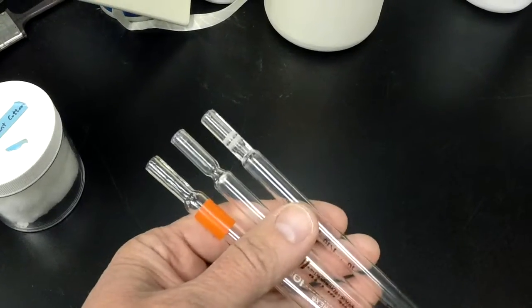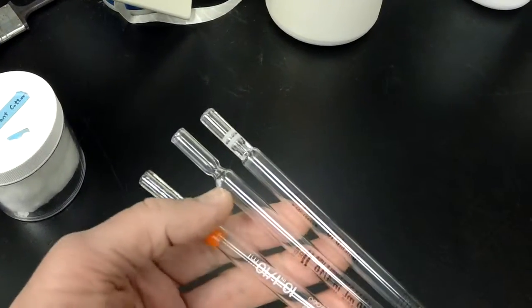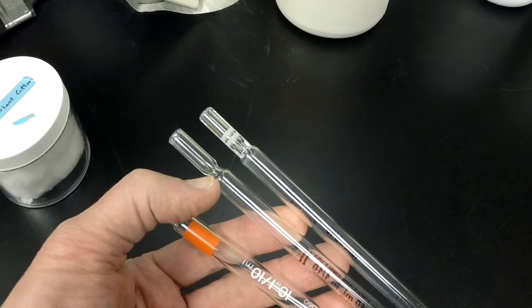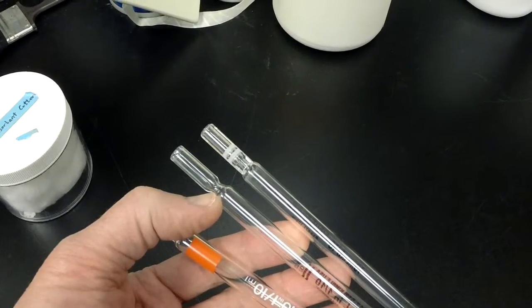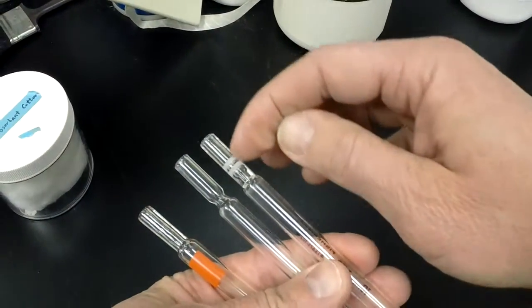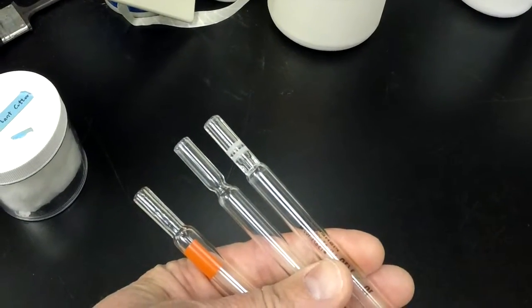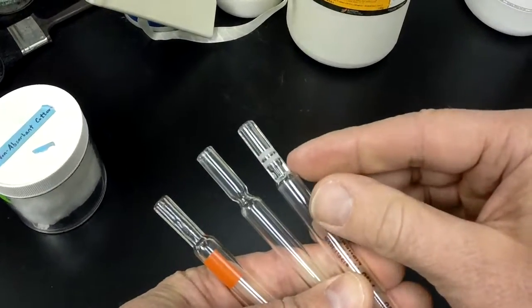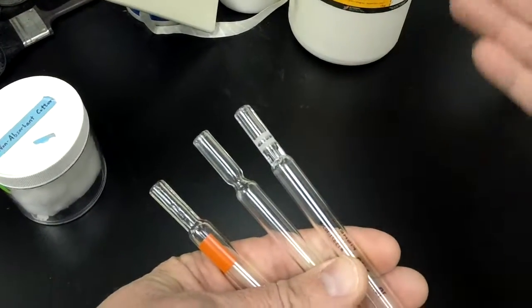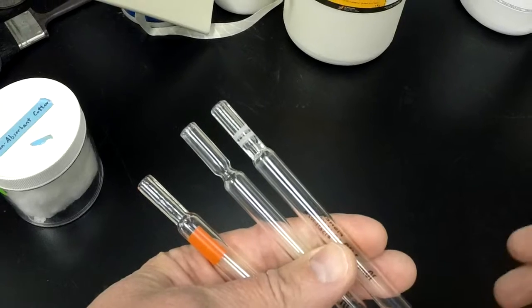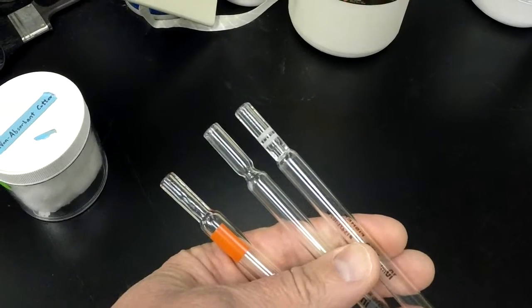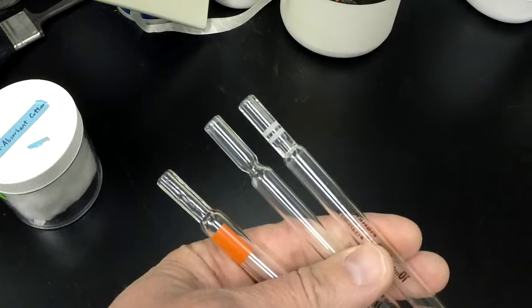Put this one in the center. This one is really obvious that it's designed with a very simple crimp inside it. And the one on the end here, it's actually on the outside—there's a molded restriction in there. That molded restriction is designed for mechanical stuffers. There are actually machines that will pack these if you need to do it in large quantities.